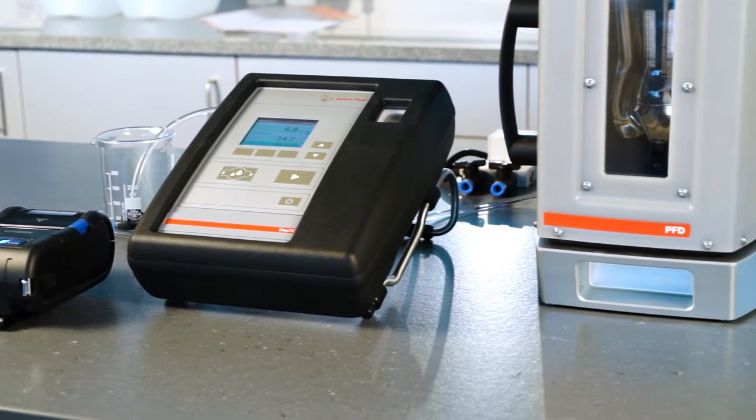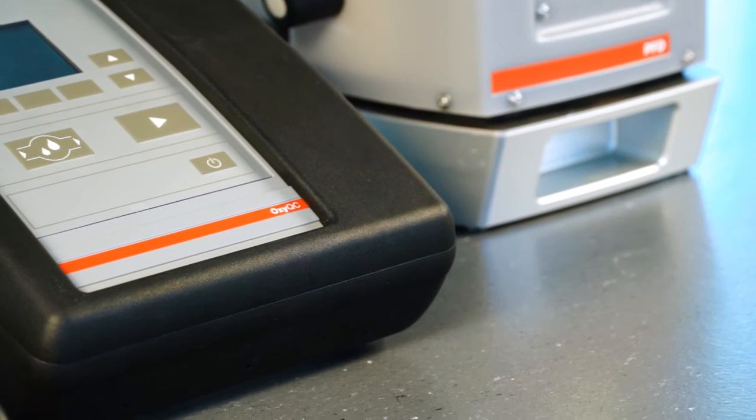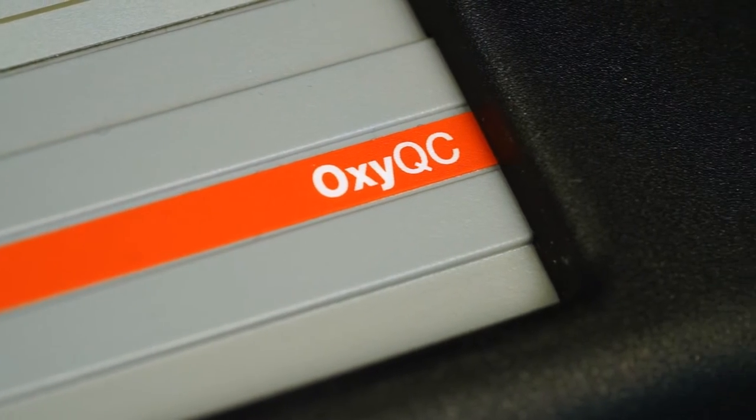OxyQC Wide Range is a portable O2 meter used to determine the true amount of dissolved oxygen. Here are five reasons for choosing this solution.